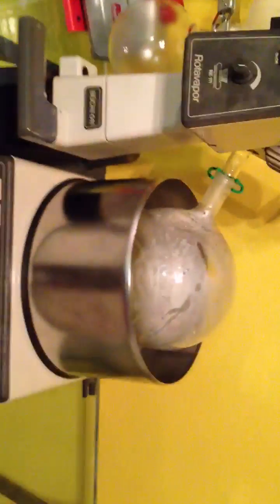Hey guys, Alvin Schultz here with Eat Drink Experience, and I'm shooting an impromptu video because I'm very excited to share with you a new addition to my kitchen: the Bucci Rotary Evaporator, or Roto-Vap for short.